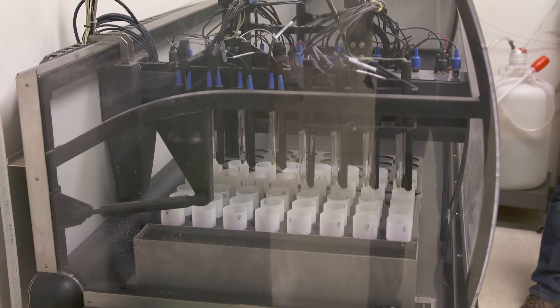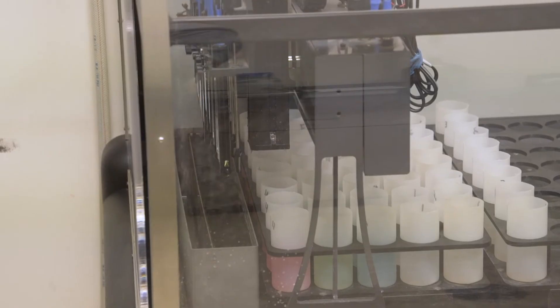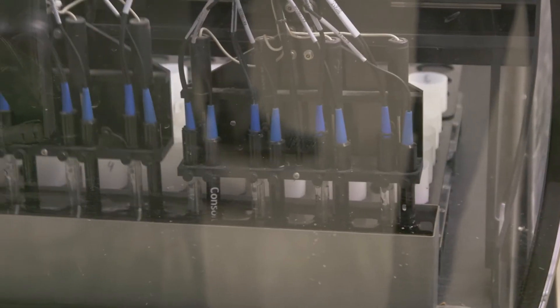This is our pH and EC robot. Every soil sample that comes into our laboratory, we measure for pH and EC — or salts — to measure the salinity of the soil. The most acidic soil we've ever tested here was 4.5 pH, which is extremely rare for Canada. That's pretty darn acidic.